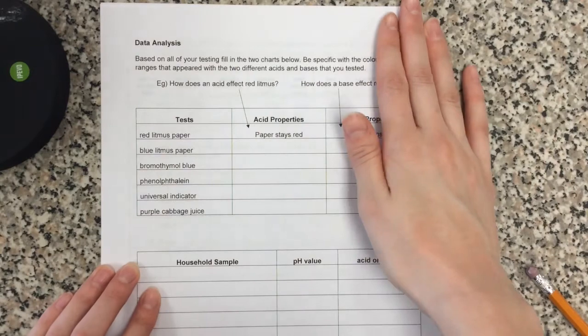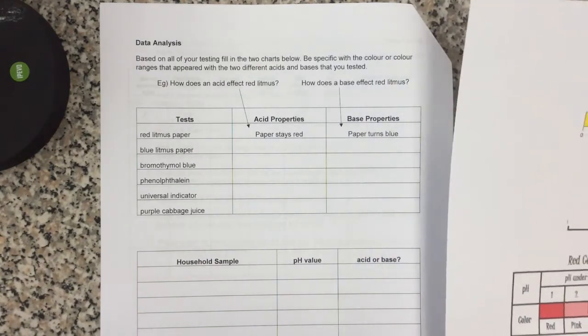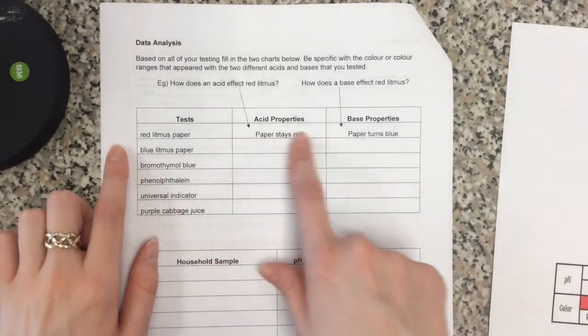So, based on all of your testing, fill in the 2 charts below. Be specific with the color or color ranges that appeared with the two different acids or bases you tested. Well, we tested more than that. What I actually want you to do for this is use this piece of paper that you should have also printed off as well. If not, that's fine. You can use the one in the video and just pause it so you can get a better look at it. I've done an example for you.